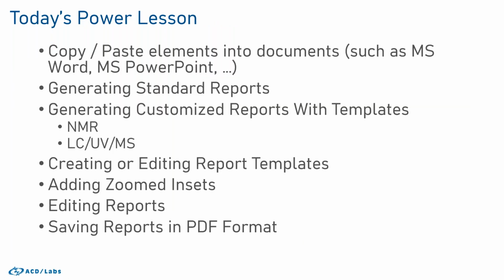For today's power lesson, Eddie's going to cover copy and pasting elements into documents, so Word, PowerPoint, how to generate standard reports, and then how we can customize reports with templates. NMR and LC/MS is what we're going to cover.